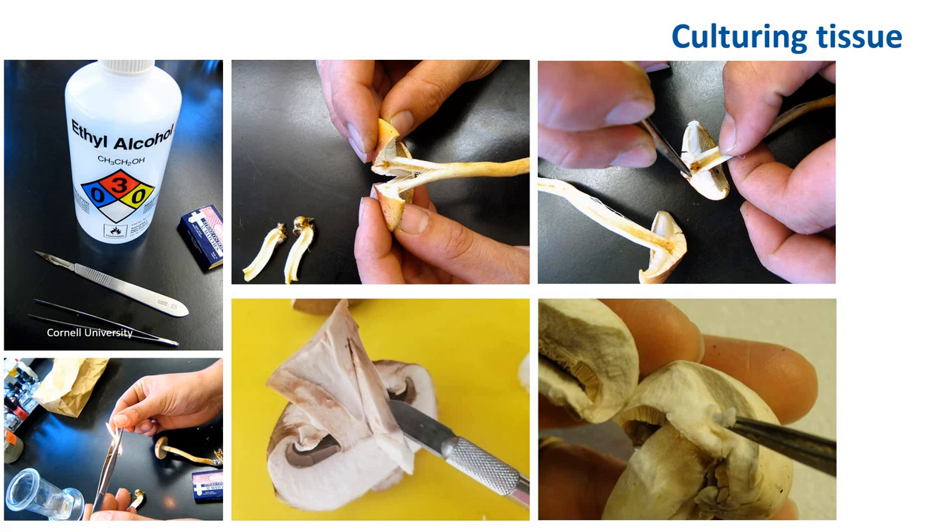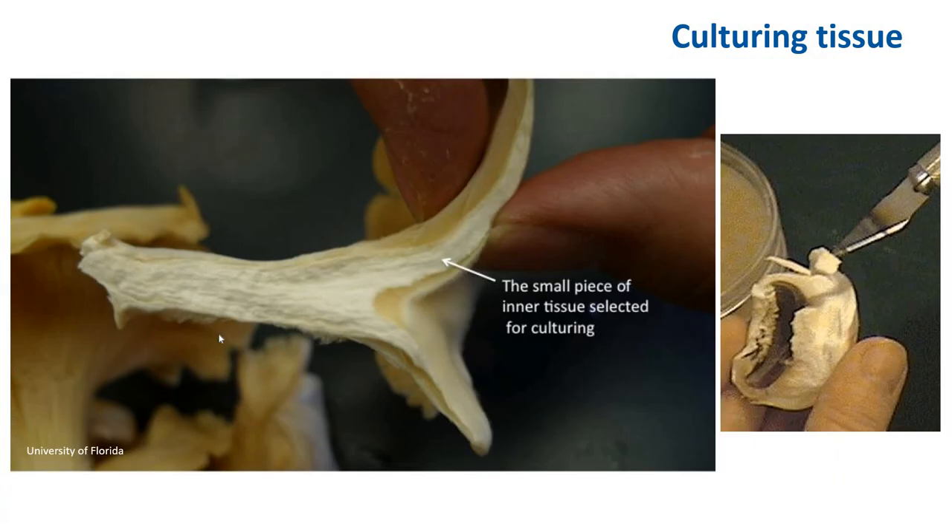This does not have to be done in the laminar flow hood or under a HEPA filter — you can do this directly on any lab bench. Here, this is an oyster mushroom, and this is where you want to collect tissue — this vegetative tissue that you can easily collect. You can use a scalpel to remove a piece of the cap and transfer it that way.